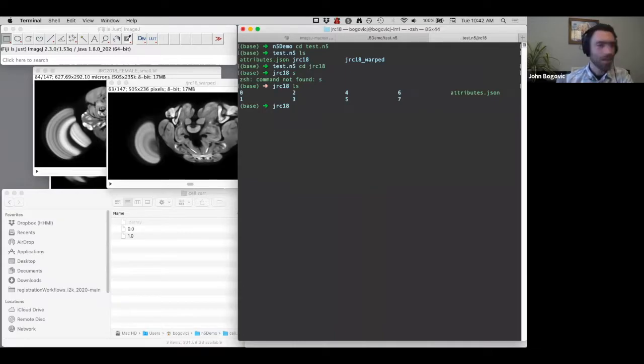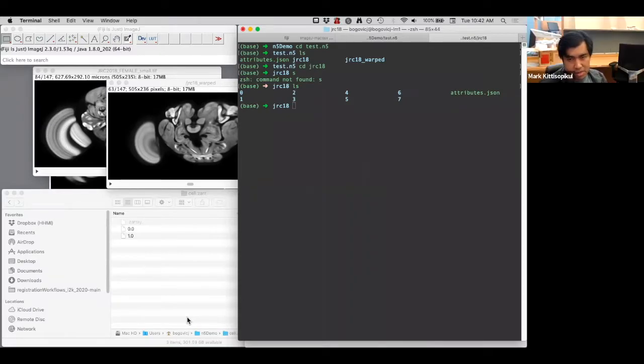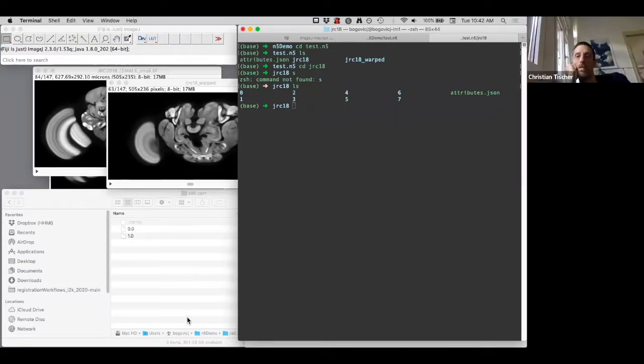I'm kind of interested in discussing the metadata, since we discussed that a few times during your presentation, and I'm really interested in how we're going to make that all work together at some point, because I think you've shown us a pretty good demonstration that we can move pixels around, and that's a lot better than where we were at some point. Looks like Christian has another question as well. Yeah, maybe you could go ahead.